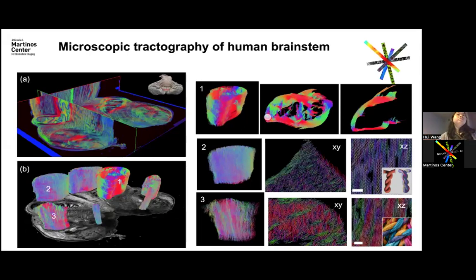We can do higher resolution than this, but this is a trade-off between the volume and the resolution.